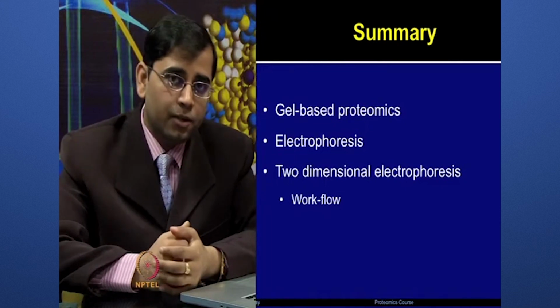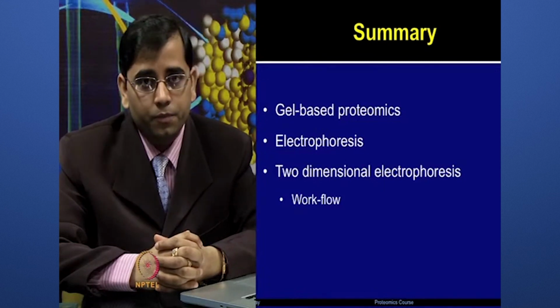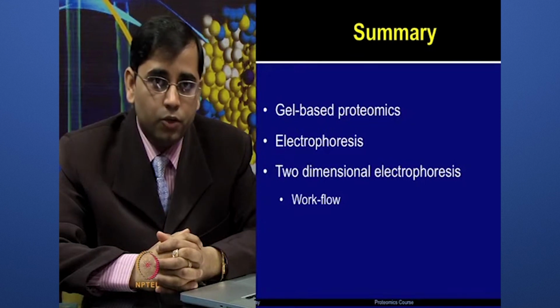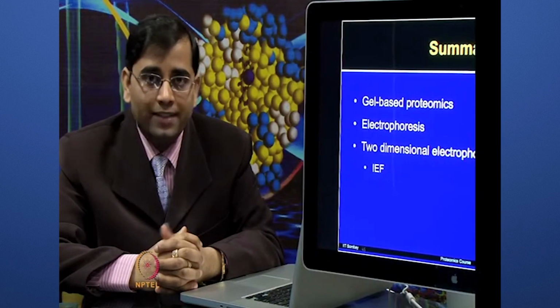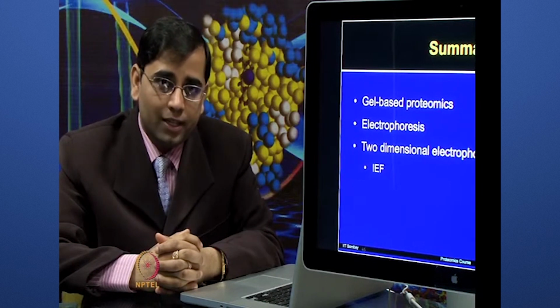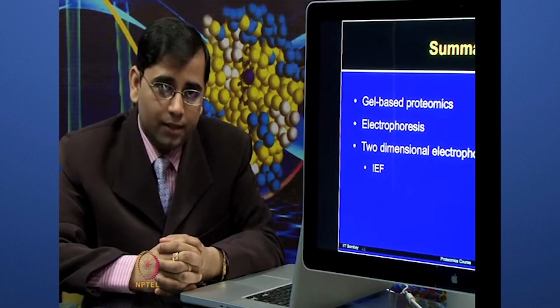Then we started discussing the details of 2D electrophoresis process, and I have given you the workflow. In that workflow, we talked about isoelectric focusing or IEF process in more detail. You have seen animation for 2D electrophoresis process as well as the laboratory demonstration of IEF process.